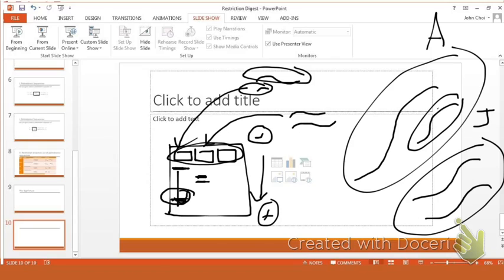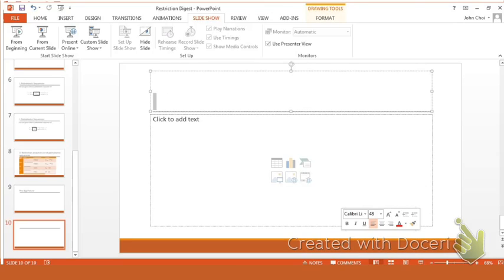And we can actually do this to the extent where you'll have about 100 band patterns, and you can match all 100 band patterns for different suspects, to see whose DNA matches a DNA you found at a crime scene or something. Okay? So the basic idea of this entire activity is that we're going to take people's DNA, cut it up with the same enzyme so that they make different sized fragments, and then run it through a gel so that we can see your specific band pattern. So every single person in the world would have a different band pattern.